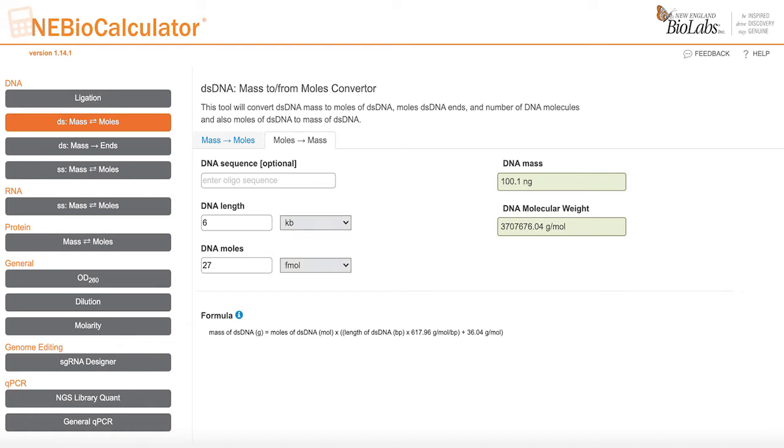Based on these parameters, you can see that to have 27 femtomoles of vector, you will need to add 100.1 nanograms of vector DNA.